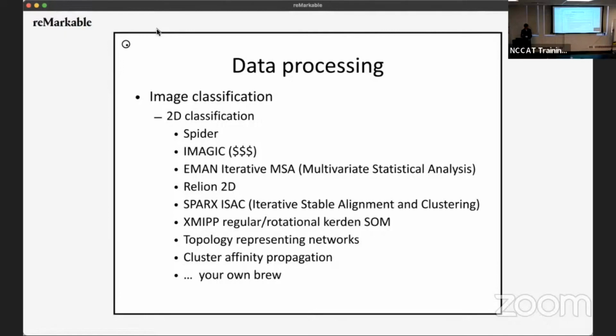And basically remove them in 3D classification, because as soon as I can generate a 3D model of my particle, the 3D classification can be much more powerful at removing bad stuff that doesn't look like the reference, while keeping the rare views.